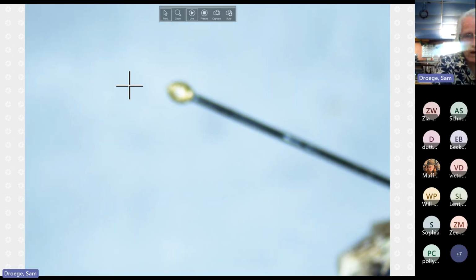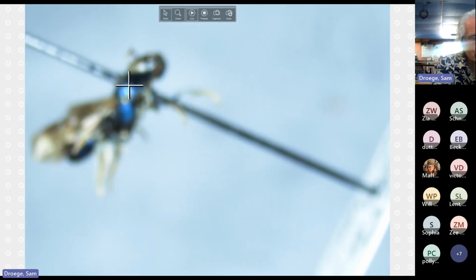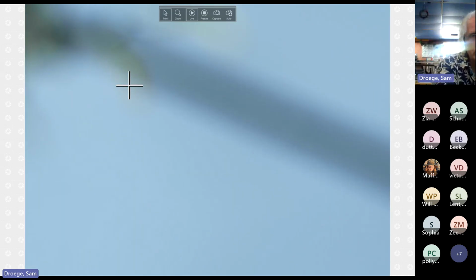So now I'm going to pull up on deck floridana. So floridana, as was mentioned, is a very southern species, and is larger than strenua, has the white ivory stripe. Sometimes this level of ivory stripe that we're going to be looking at here is, I would say, ambiguous. And so when dealing with floridana, a lot of times what we're doing is setting it aside, setting it aside, setting it aside, and returning to it for more study.